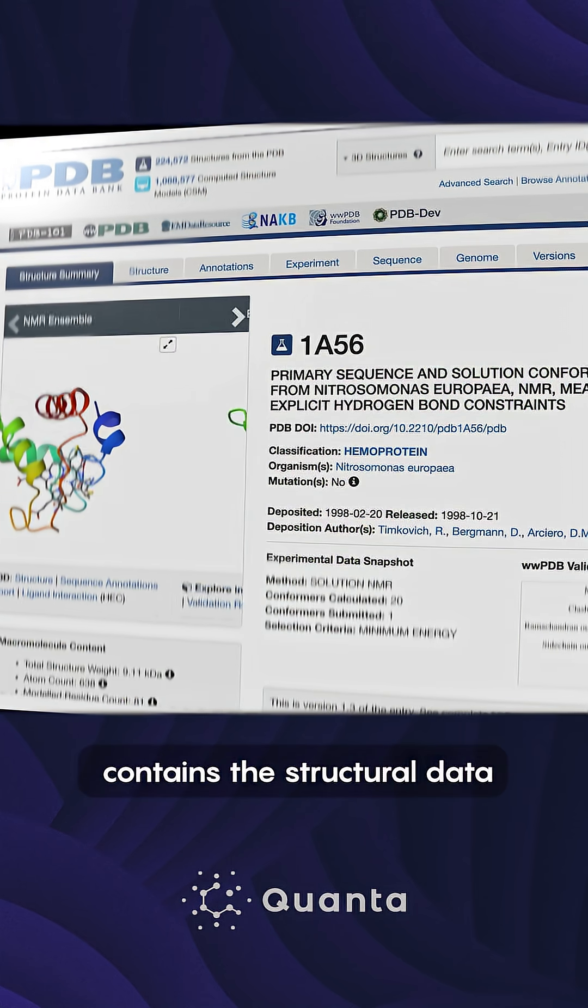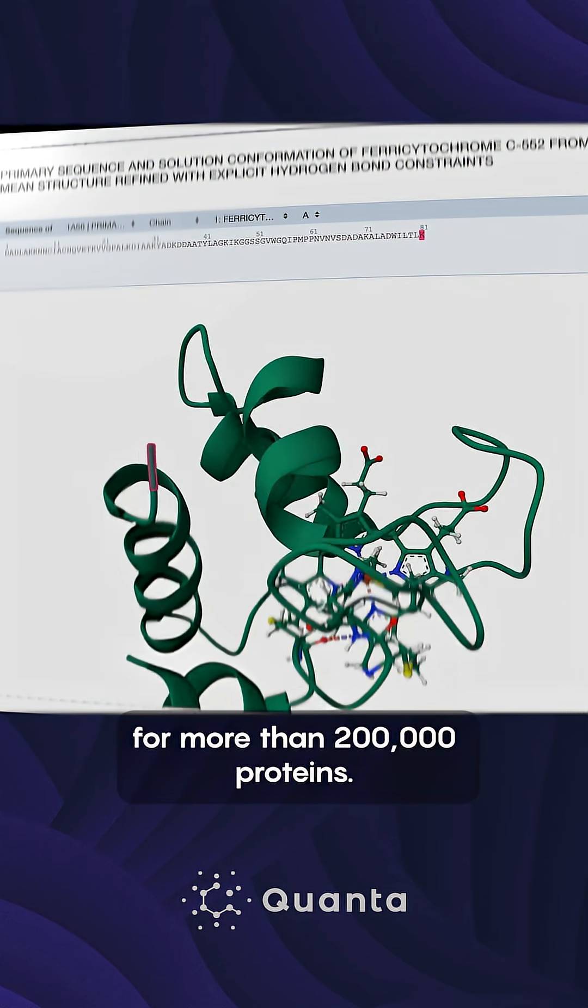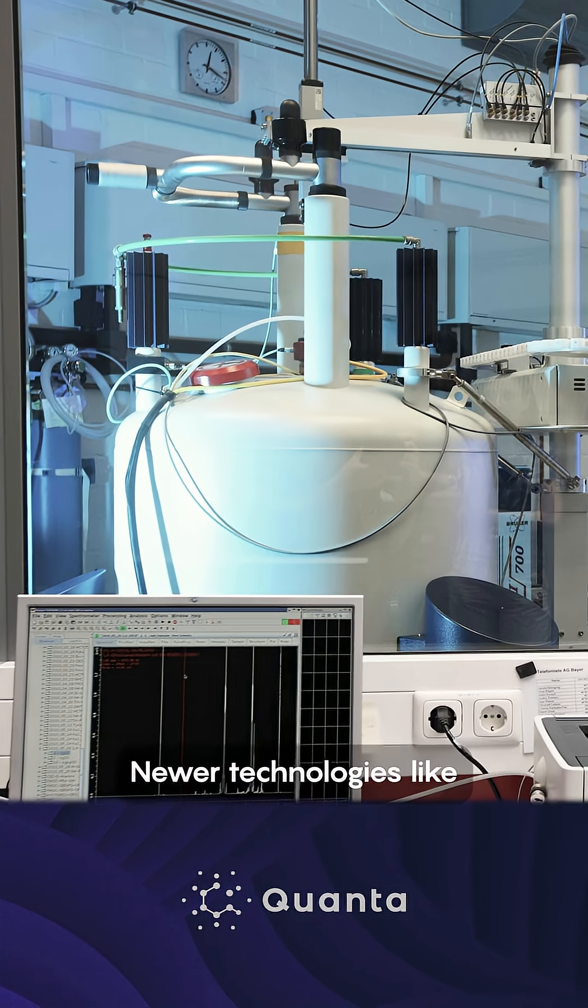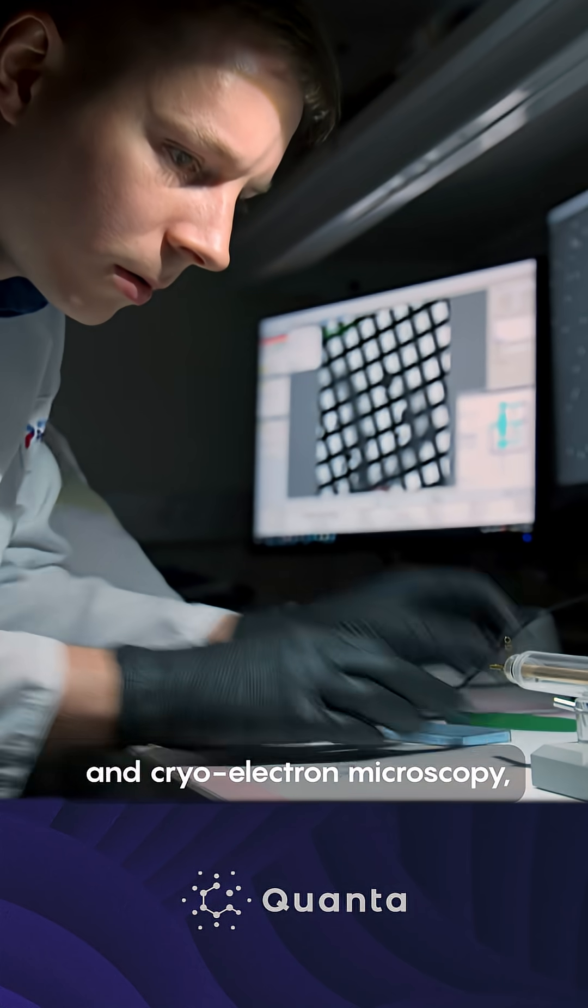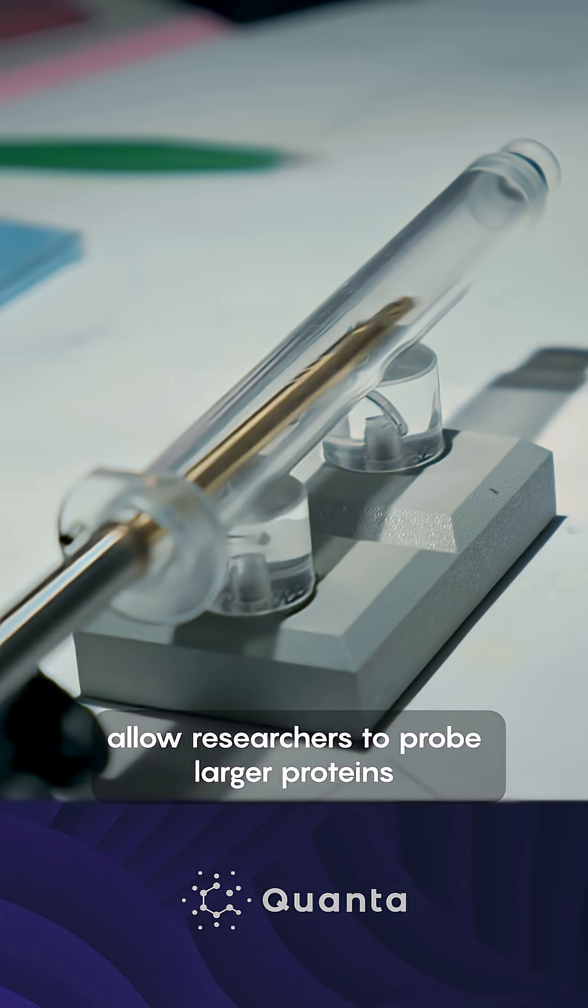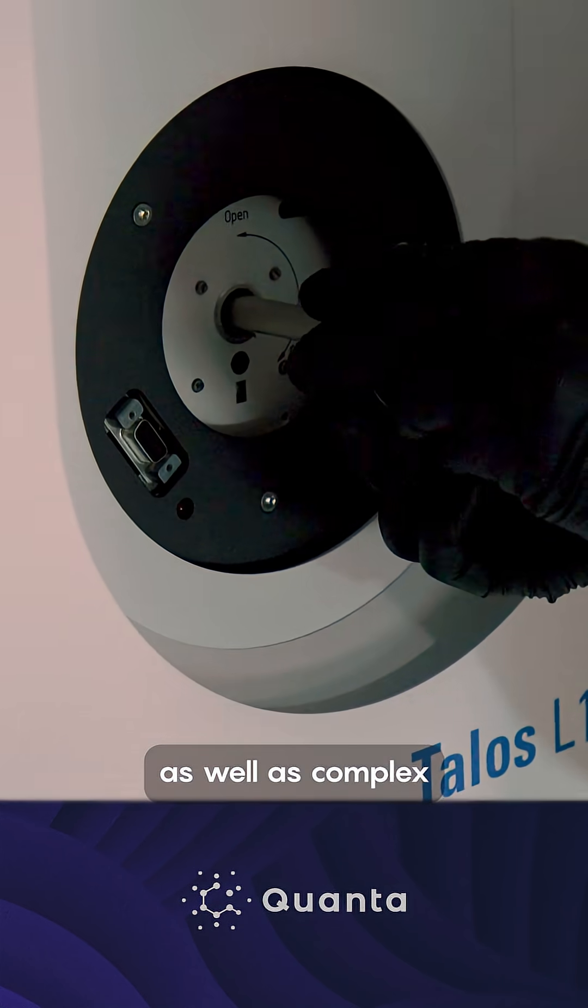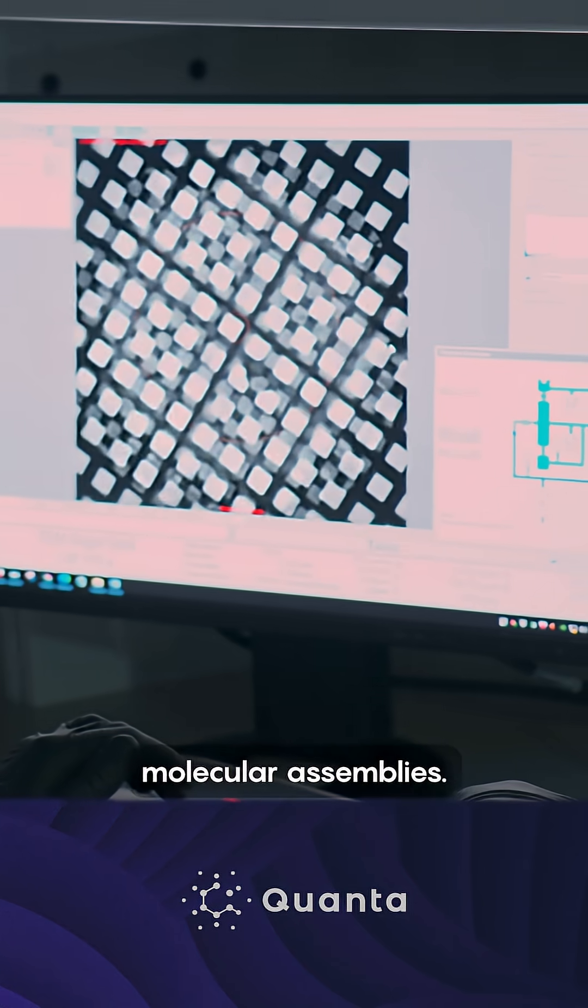Today, the PDB contains the structural data for more than 200,000 proteins. Newer technologies like nuclear magnetic resonance and cryo-electron microscopy, or cryo-EM, allow researchers to probe larger proteins as well as complex molecular assemblies.